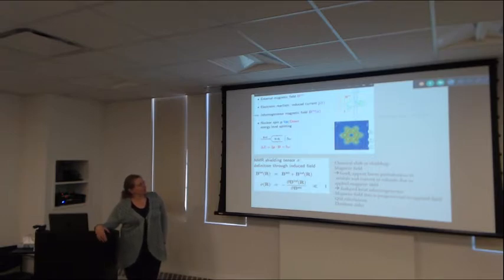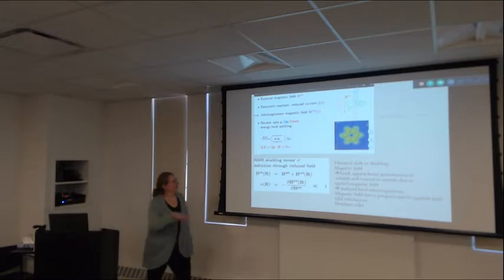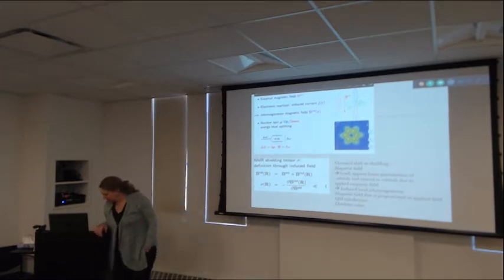So those perturbations on the molecule can be thought of as introducing another local magnetic field. You can talk about susceptibility, like we talk about with bulk properties, like Gouy balance kinds of experiments, or you can talk about it very locally as introducing local magnetic fields. We'll probably talk about it mainly in the second way. So the total magnetic field could be the one you applied plus a little something extra that the molecule gave you. It's like a new magnetic field.